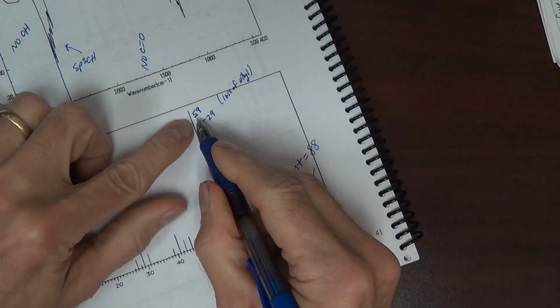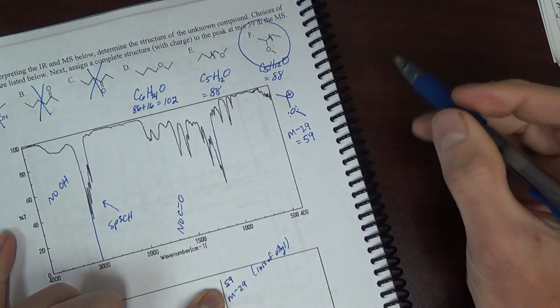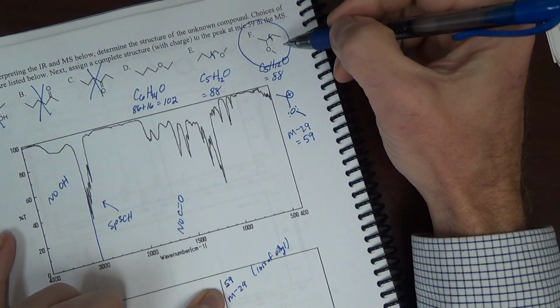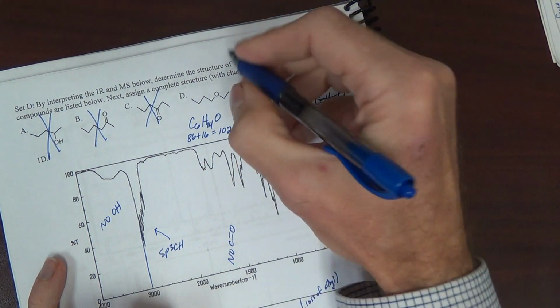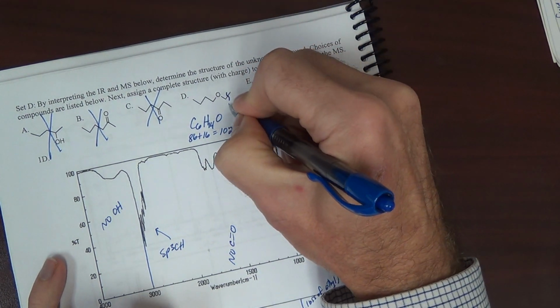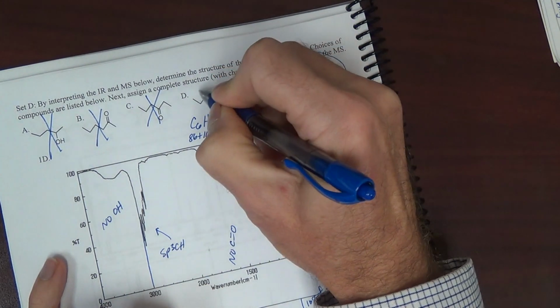The base peak is 59. Which compound up here do I expect a cleavage to give 59? The one on the end? Not that one. Nor this one, because this one I would expect to lose 15 or 43.